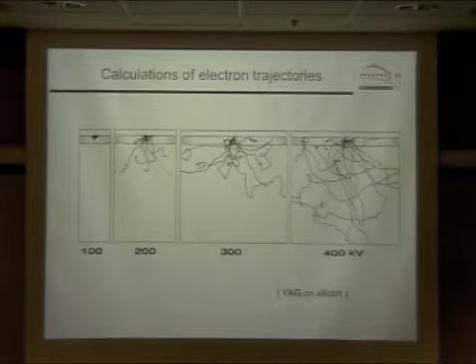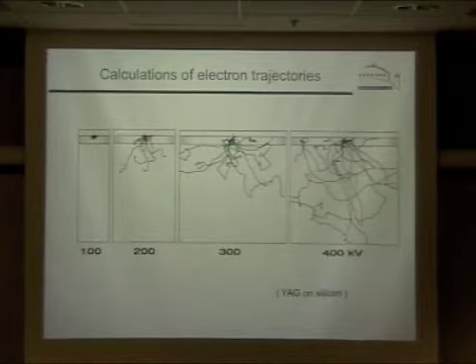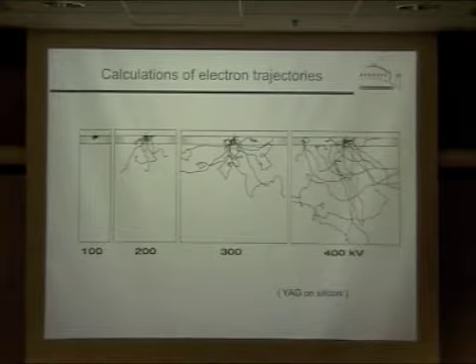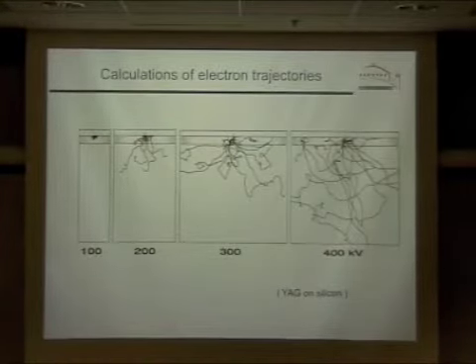That's a really bright signal for that one electron. There's another one here, I think this one here, that only loses 10 kV of energy. I'm making that up, but that's an example. A lot of these lose on the order of 30 kV of energy in the scintillator. That's converted to light.